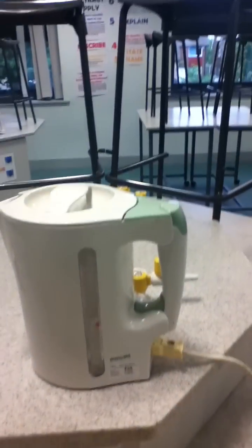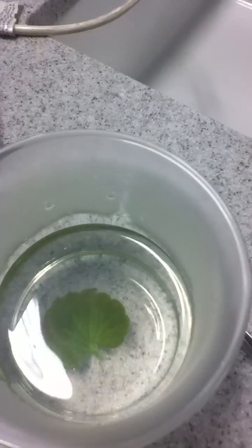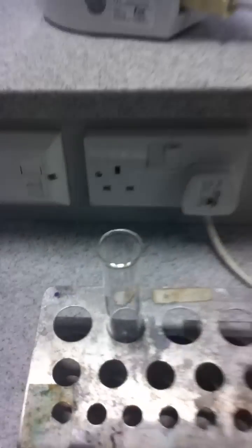Step one: the kettle has just boiled. We put the leaf in the beaker, take some freshly boiled water, and pour that onto the leaf. Then we're going to leave it for a few minutes. What you want to happen is for that leaf to go really soft in the boiling water — give it a minute or two until it goes all soft and starts breaking down a little bit.